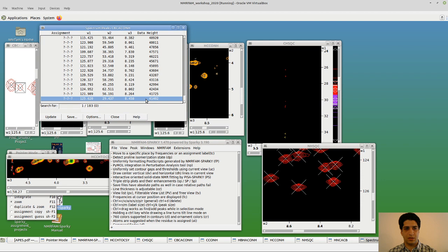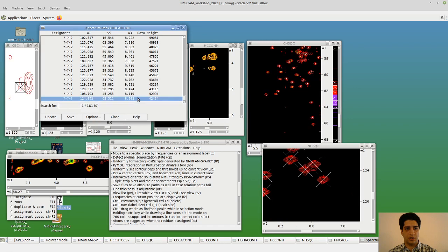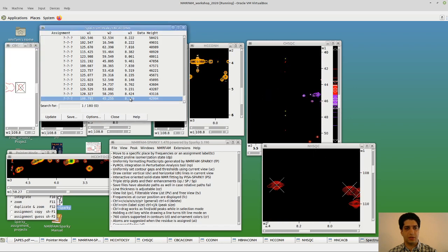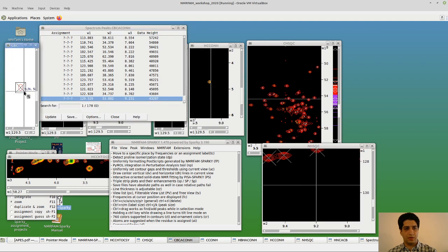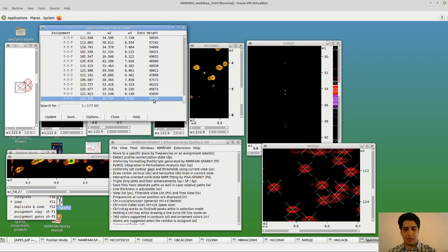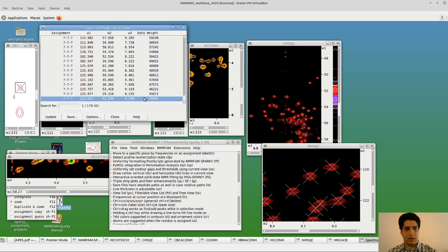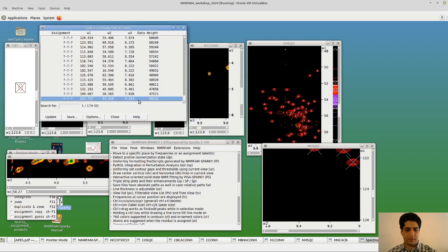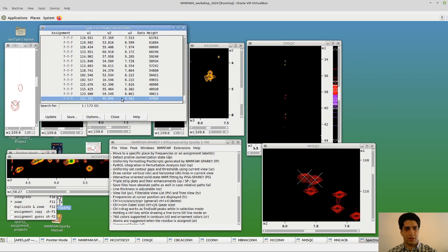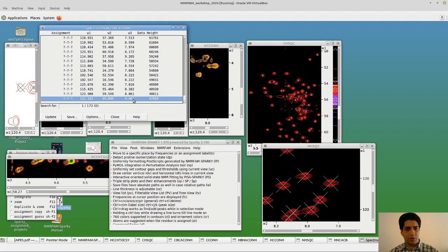Okay, this is not something that we are interested in. Delete. Next one, delete. Yeah, this is not a peak. Delete. Delete. I'm going to delete this one too, and so on. Yeah, this is not a peak. Just follow this procedure. Okay, I'm going to stop around here.